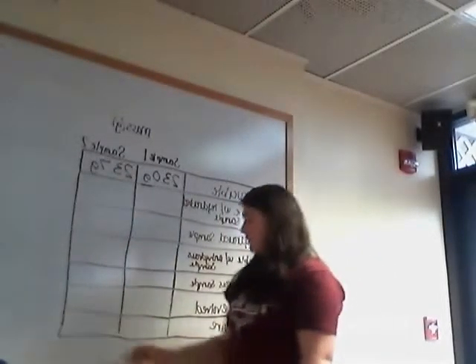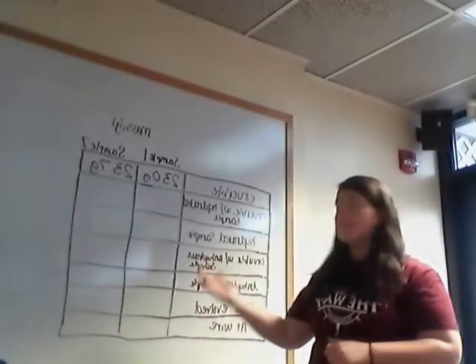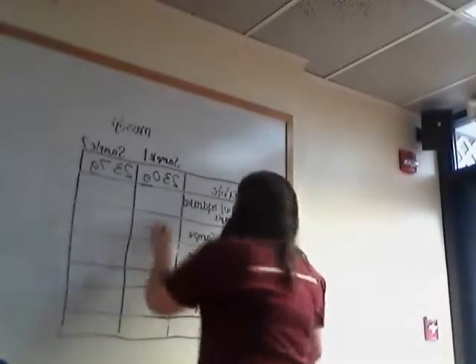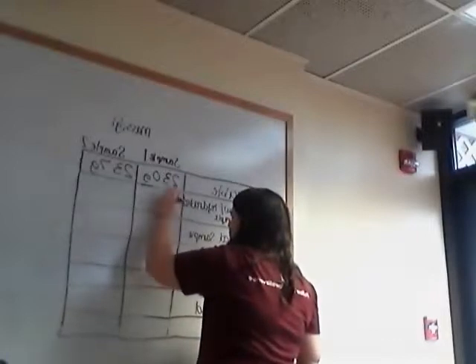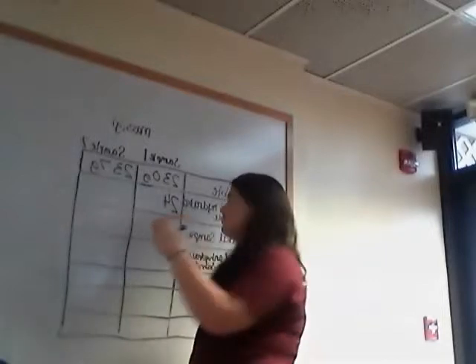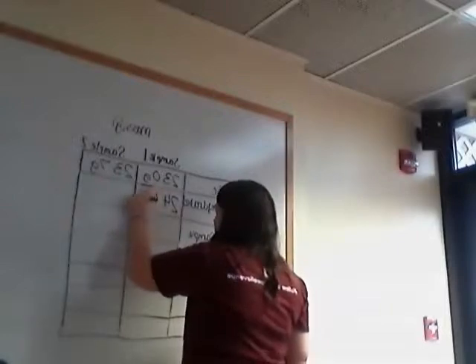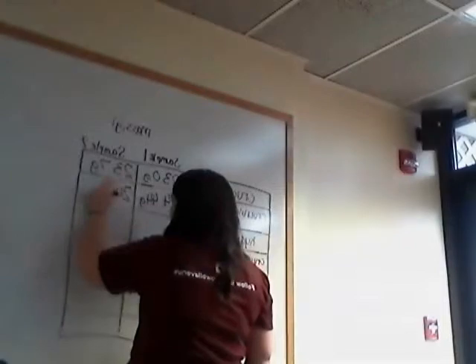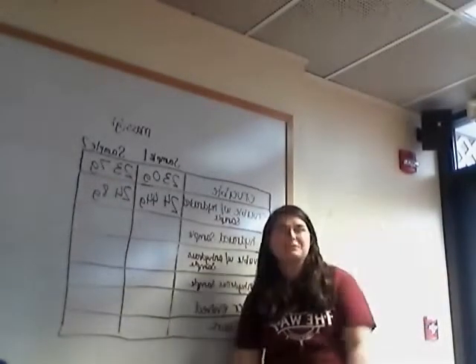After measuring the crucible, you now have to measure your crucible with your hydrated sample of copper chloride. Our first sample was 24.44 grams. The next sample was 24.8 grams.